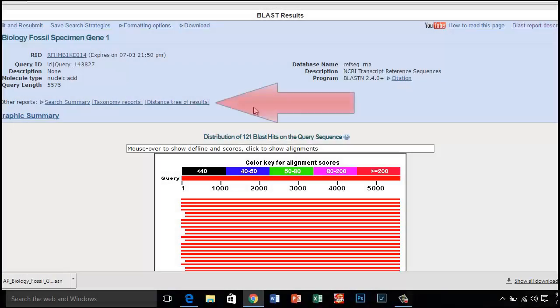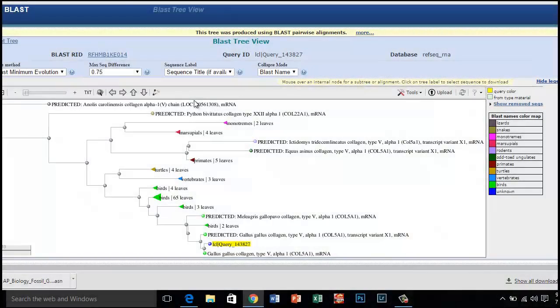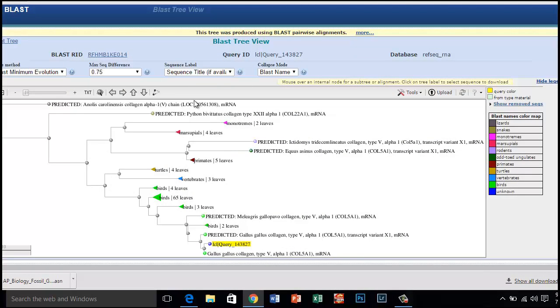A cladogram of the species with similar sequences to your gene of interest placed on the cladogram will be shown according to how closely their matched genes align with your gene of interest.